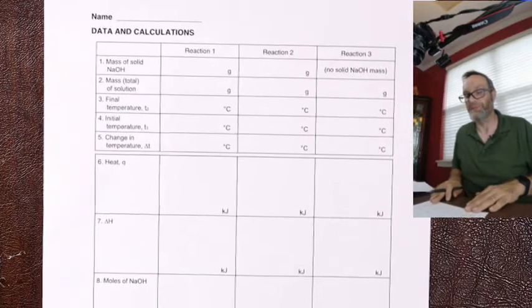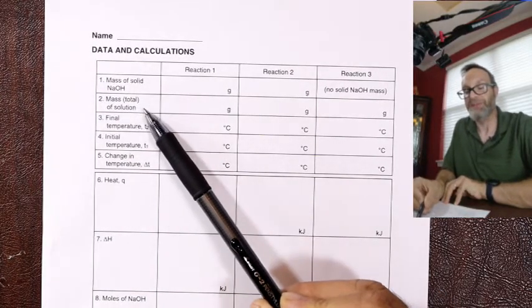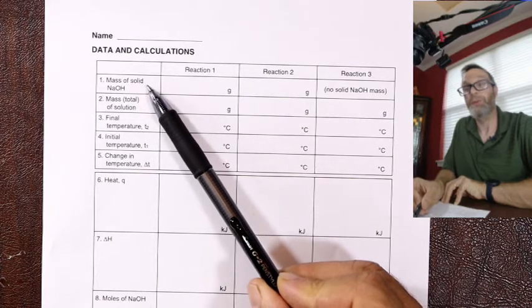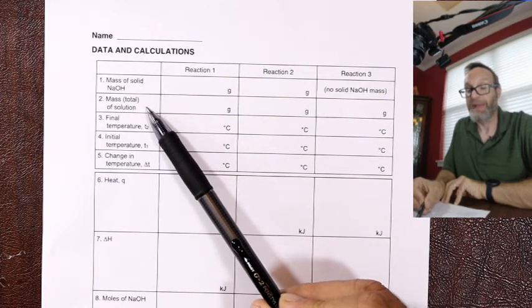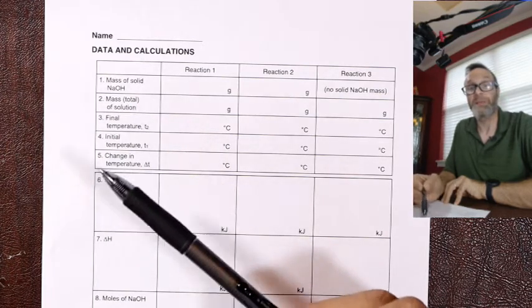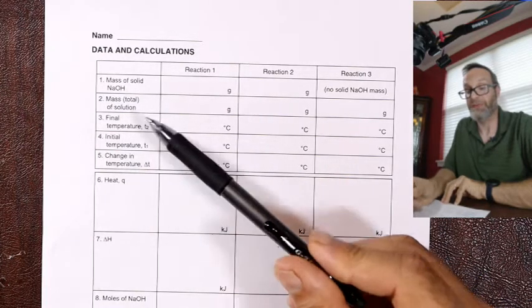All right, so if we just look through this data sheet real quick, you've got masses of reactants, masses of solutions. So this gives us moles of a reactant, the limiting reactant. That's just like the one in the packet. Mass of solution: remember the m in Q equals Cp m delta T, that's the mass of solution, so you need that.